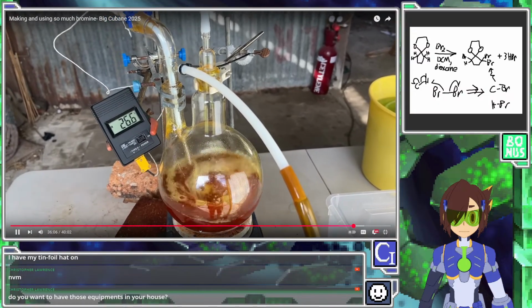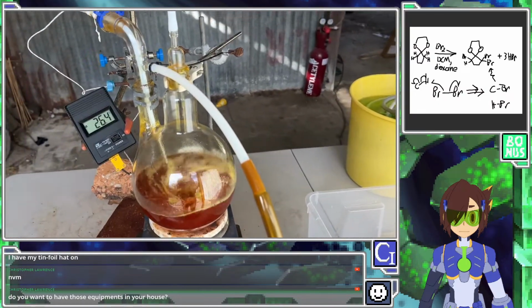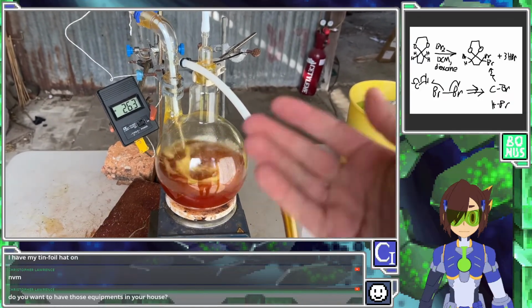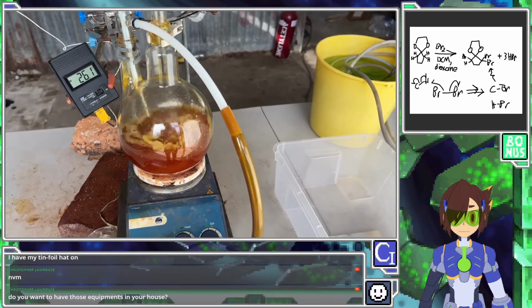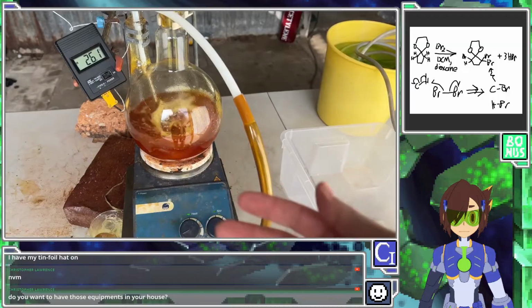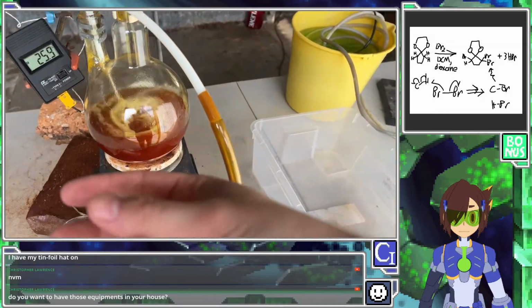Brominated product out of there. Well, first of all, we've got to get rid of all this HBr gas. We've got to slowly add some water and then add some sodium sulfite, which will destroy any remaining bromine, and then finally add some sodium hydroxide and sodium carbonate, which will react with and neutralize any acid, any HBr. So once we have that, we have the water layer and the dichloromethane layer. We'll take the dichloromethane layer out.